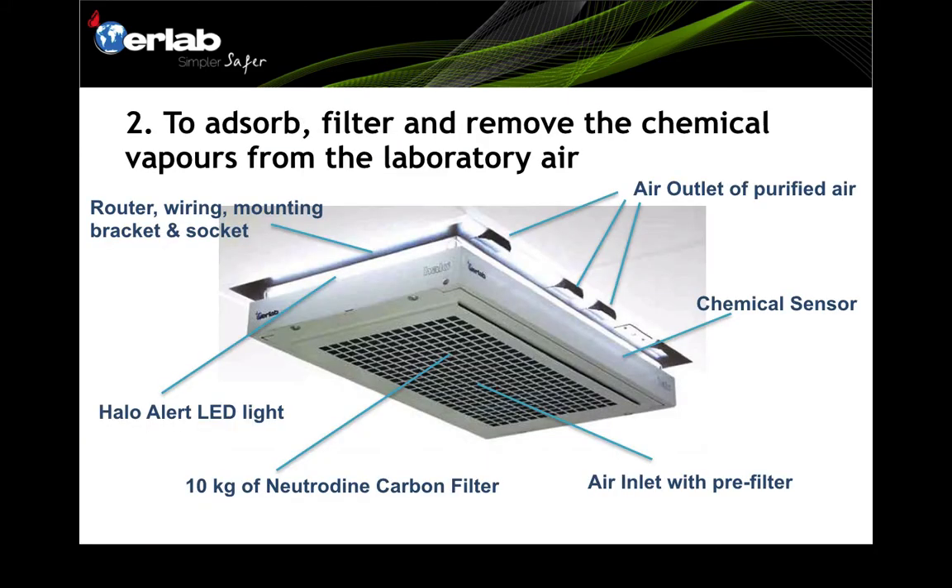Number two — to absorb, filter, and remove chemical vapors from the laboratory air. A typical Halo unit is equipped with the following components: the air outlet for purified air, chemical sensors matched to the filter type (VOC sensors for VOC filters, formaldehyde sensors for formaldehyde filters), air inlets with pre-filters, and above the pre-filters, 10 kilograms of Neutrodine carbon filters to absorb and remove chemical vapors.